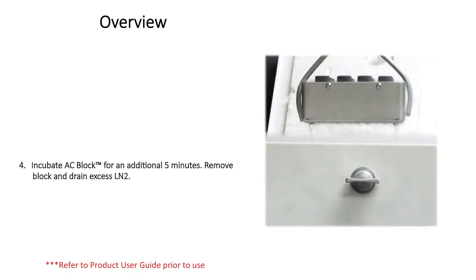Allow the vials to incubate for several minutes to allow samples to freeze. Remove the AC block from the cryo cooler and briefly allow excess liquid nitrogen to drain from the bottom holes.